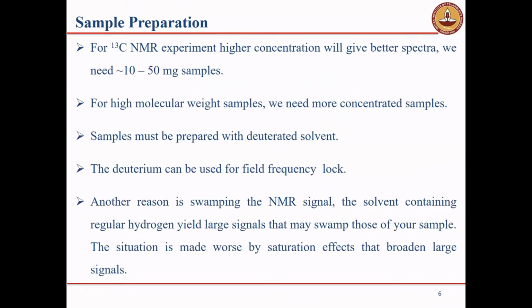For a C13 experiment, a higher concentration will give a better spectrum. For C13 experiments, we need 10 to 50 milligrams of sample. For high molecular weight samples, we need more concentrated samples.